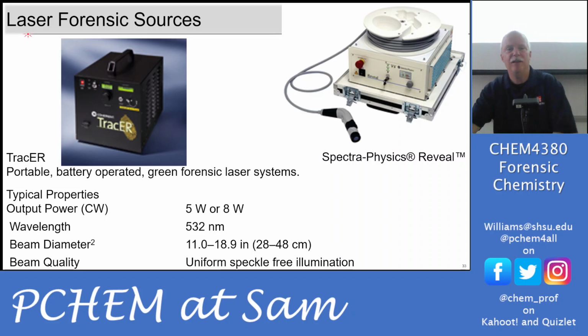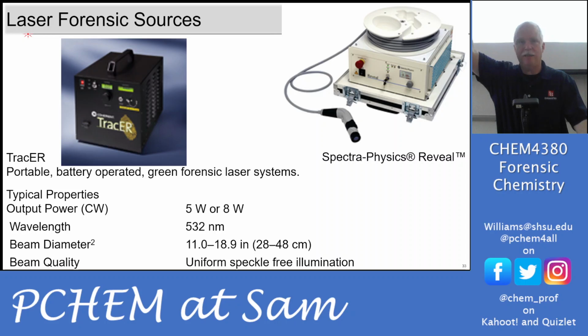And then even brighter than LEDs is if you put that light-emitting diode in a resonant cavity and make a laser out of it. So these are incredibly bright. This light is not that bright, and the farther I get away, the less effective it is.